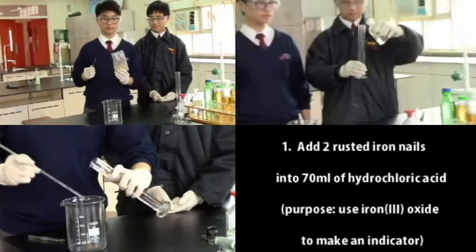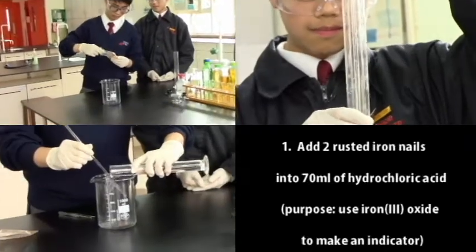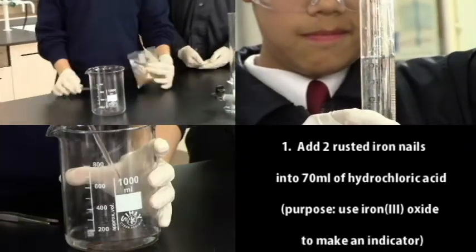First, put two rusted iron nails into 70 milliliters of 2 molar hydrochloric acid. Stir and allow it to stand for 10 minutes.